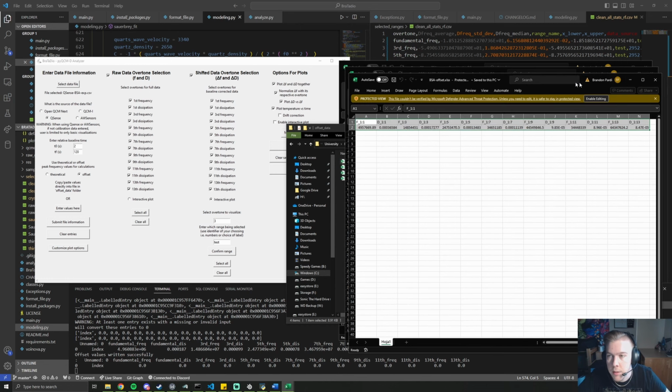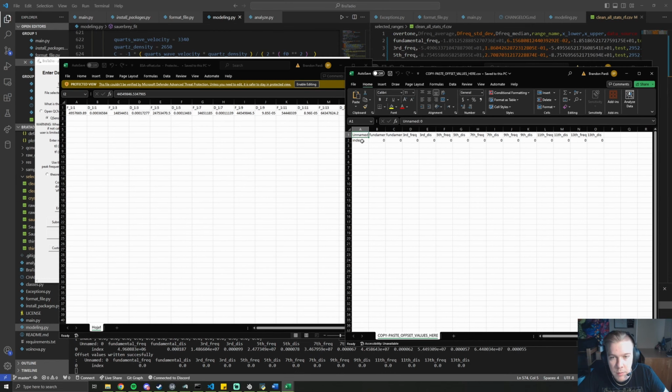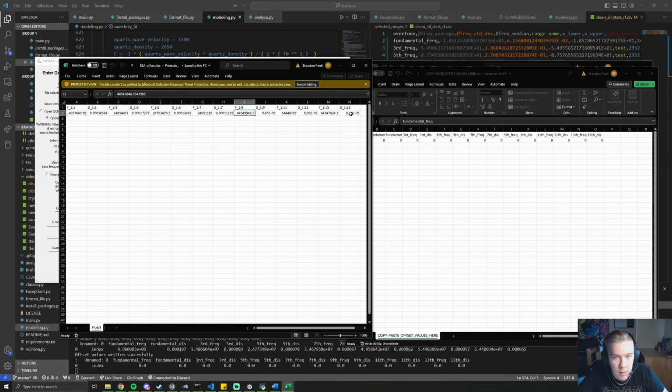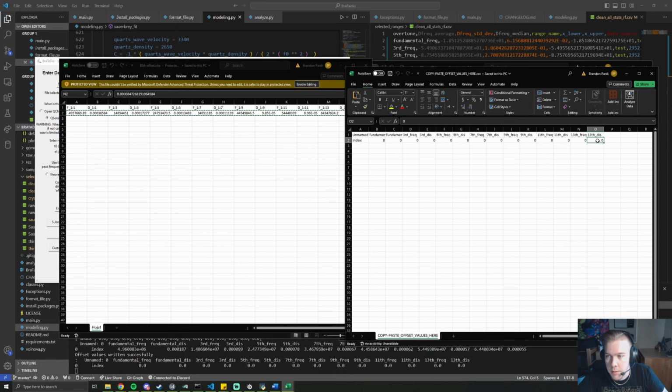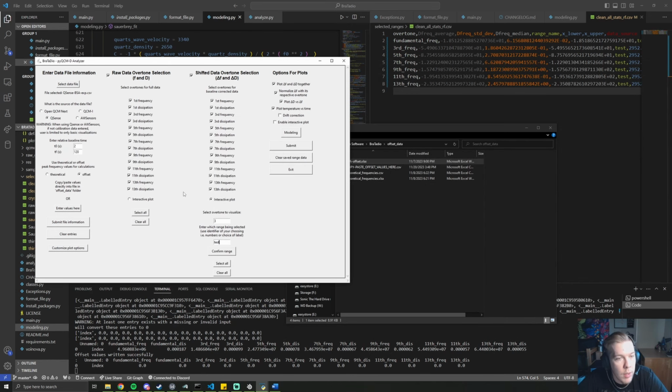All the spreadsheets today. And then make sure that you do not alter these two columns, as it relies on the index column. And all the header columns as well, make sure to leave those as they are. You can just go ahead and select everything here, copy it, then paste it in this one, make sure we save it, close everything out, and now we can proceed.